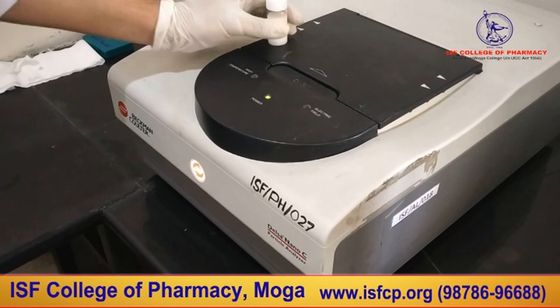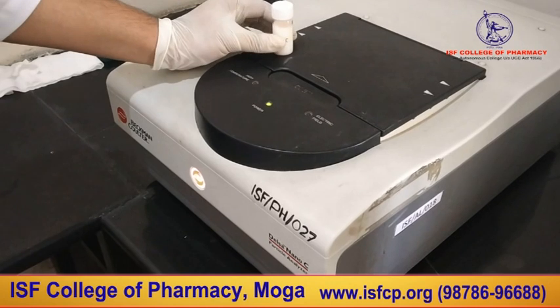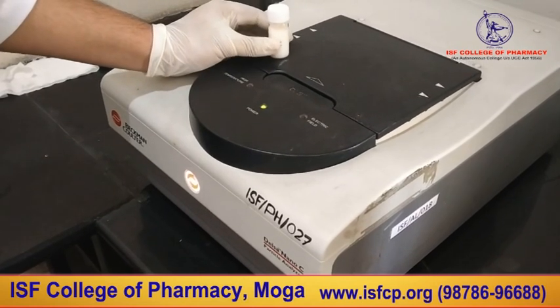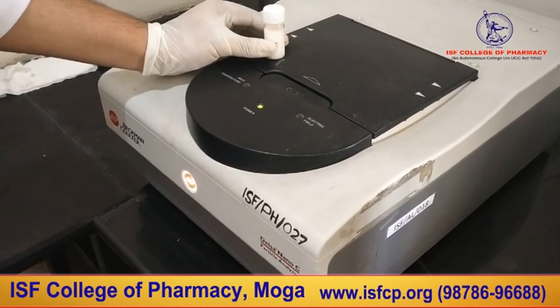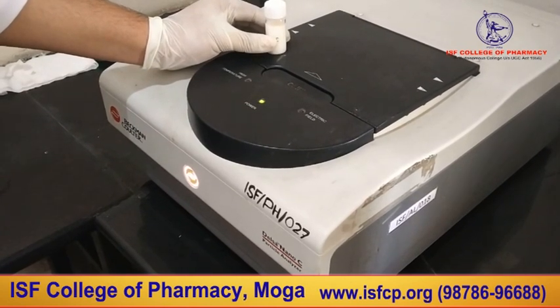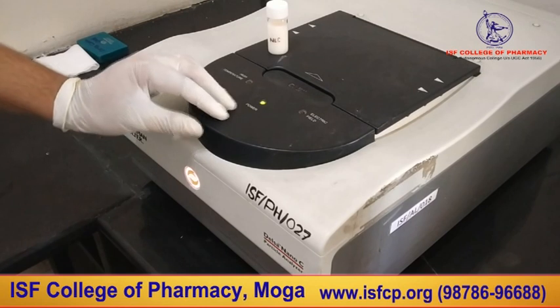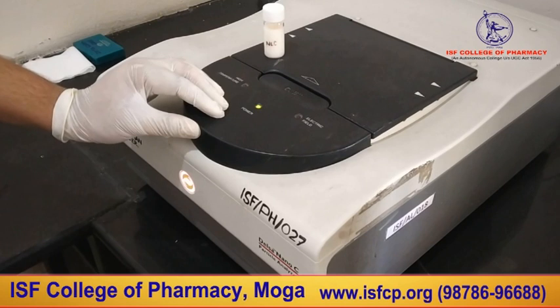The basic principle of Delsa Nano C is photon correlation spectroscopy, which determines particle size by measuring the rate of fluctuation in laser light intensity scattered by particles as they diffuse through a fluid. The range of particle size we can measure with this instrument is 0.6 nanometer to 7 micrometer.